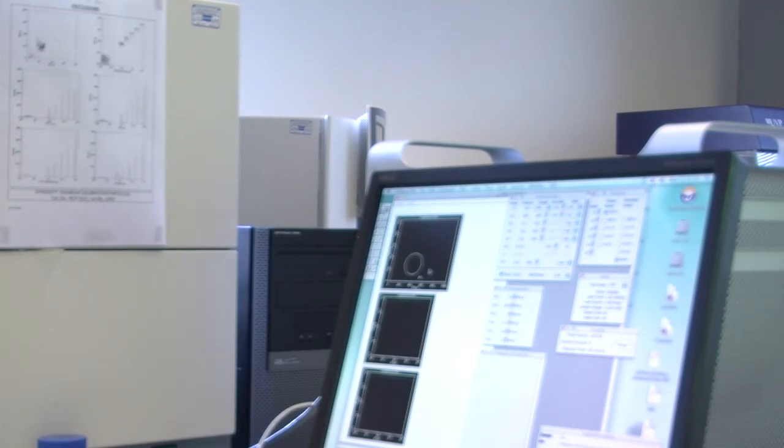So make sure you label your three tubes. You might as well do that now while you're waiting for the centrifuge. Yeah, just write straight on the plastic. It's fine. And also, if you're the ones doing the isotype match control, please put IMC on all of your tubes, because if not, we may end up getting confused about what's what. I know you're going to bring your tubes and so on, but if you're running the isotype match control, those are the ones we need to run first. That's great.